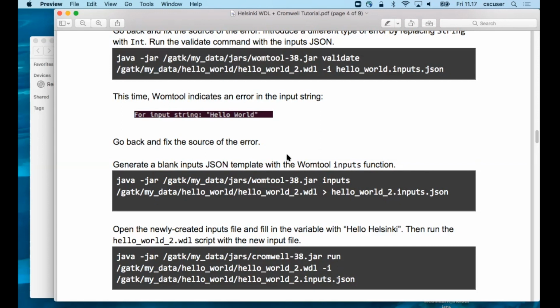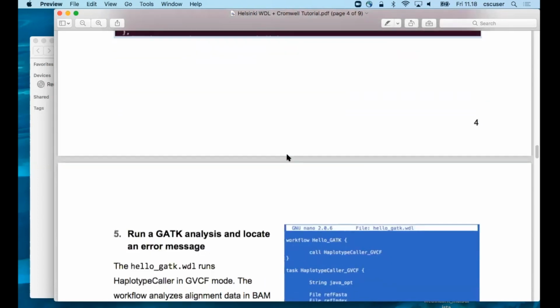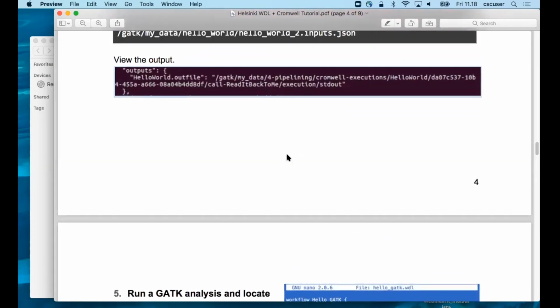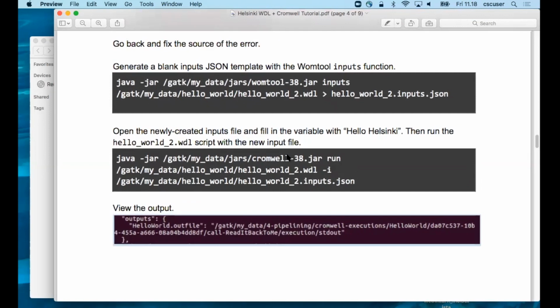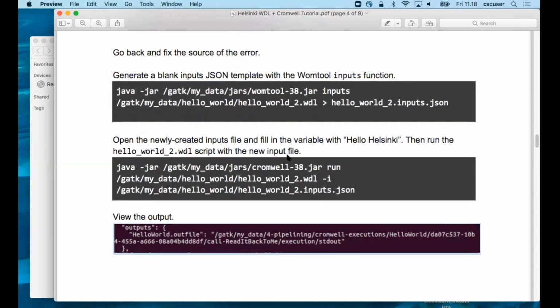How do I know that it's using the right values in the right places? Okay. You can see one of the files that is created in the kernel execution directory is called script, and helpfully that contains the actual script that gets run when it executes, and that includes the command block completely interpreted with all the file paths and stuff like that. So you can see exactly what files and what values it's using for every parameter. So you know exactly what it's doing. That can be very helpful for troubleshooting if you suspect that it's one of the values.